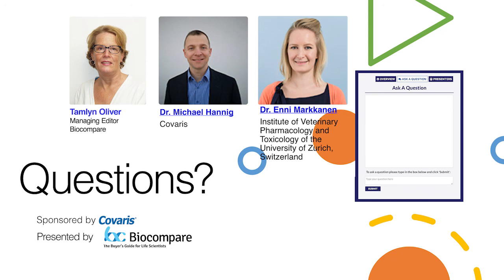Okay, Enni, have you analyzed human tissues using this method? Yes, we have. We have several collaborations with different hospitals and research groups from human hospitals, and we have analyzed tumor cells. We have analyzed tumor stroma coming from human samples. We have also analyzed other types of diseases, such as psoriasis-like diseases.